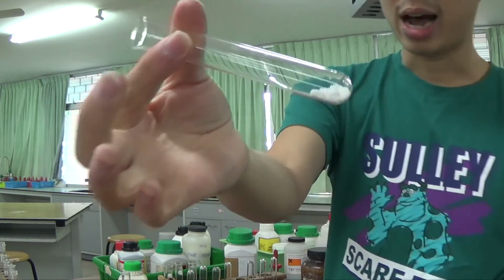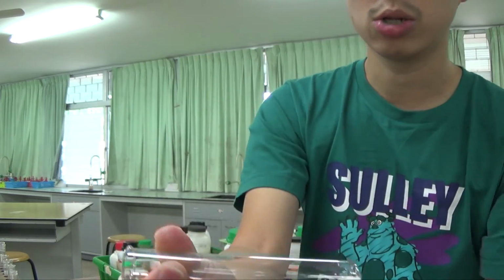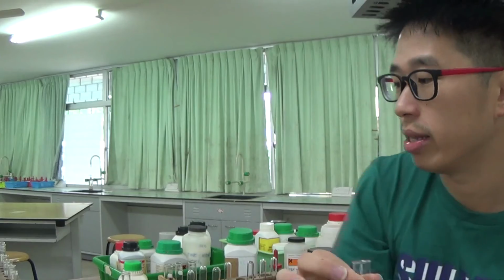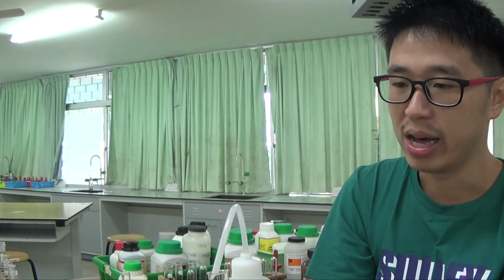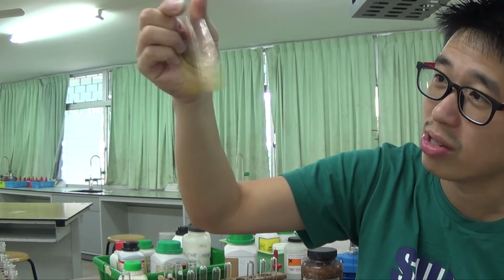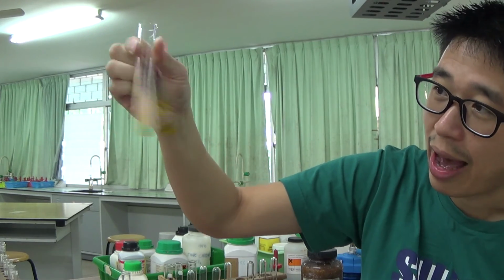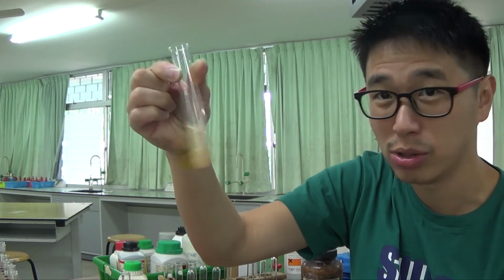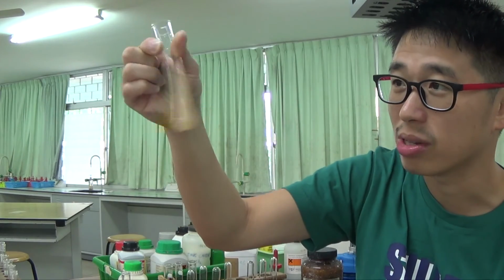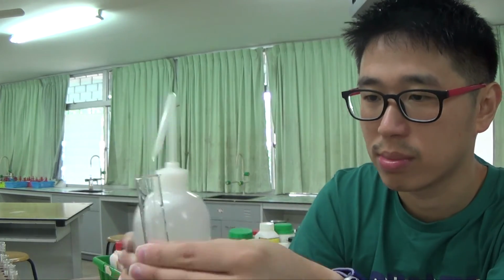Of course it's hydrated, but I'm not going to show you the heating bit about the water of crystallization. Those were already covered in the other tutorial videos. What I'll show you, however, is a qualitative analysis of a double salt. So this compound is kind of soluble in water, but not very soluble in water. So I might just try and dissolve it as much as I can, and then I might just take the solution out, because I do not want to be testing the solid, I want to test the solution. So I might need to add a bit more water to dissolve it actually.